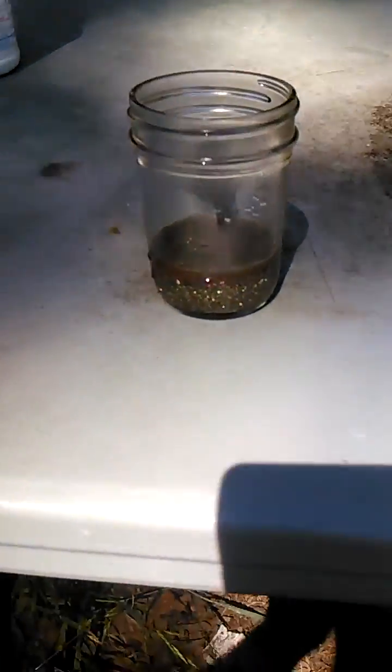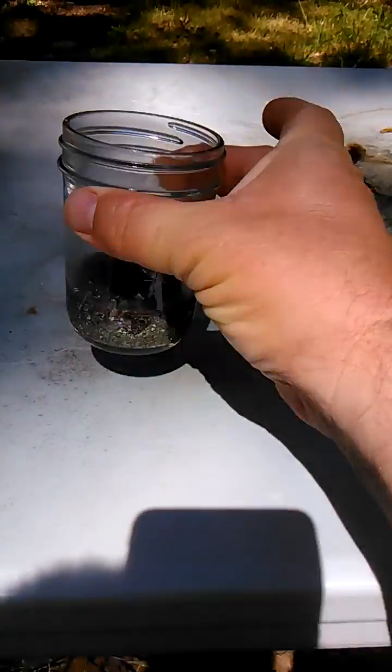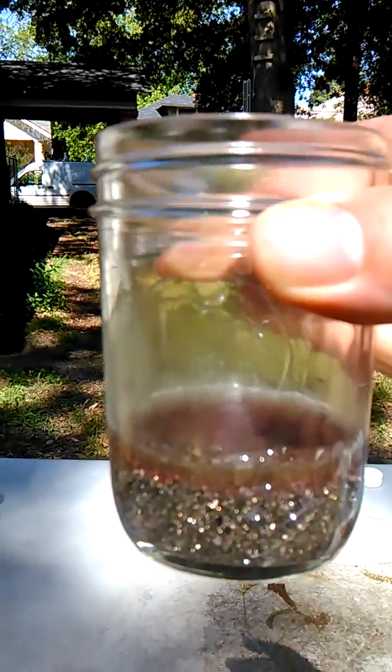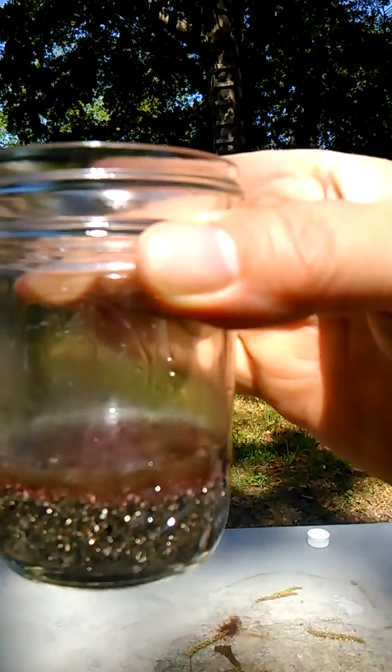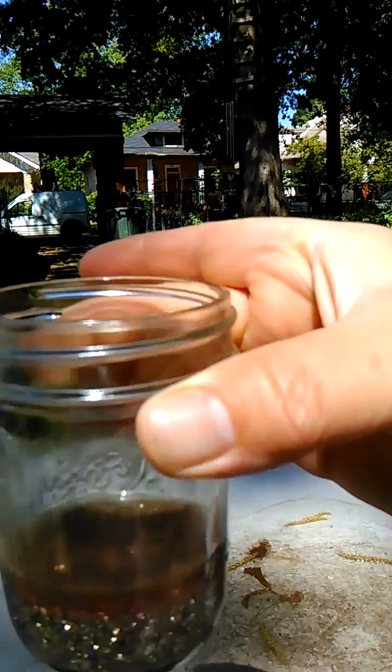I know people have asked me about this and now we are finding out — the color of the liquid is changing. It appears to be extracting, dissolving and extracting.